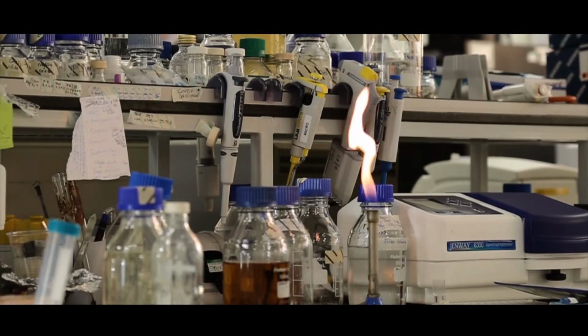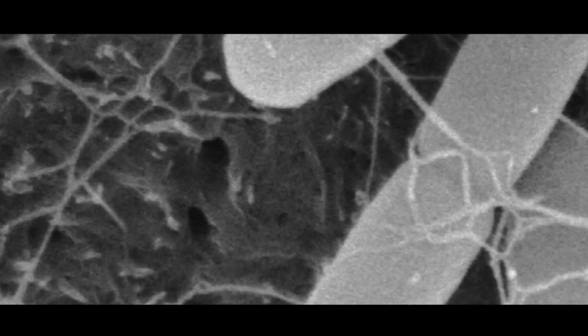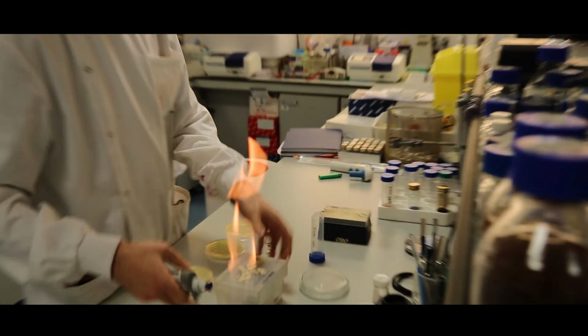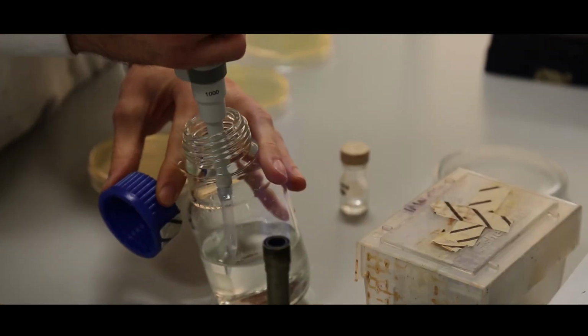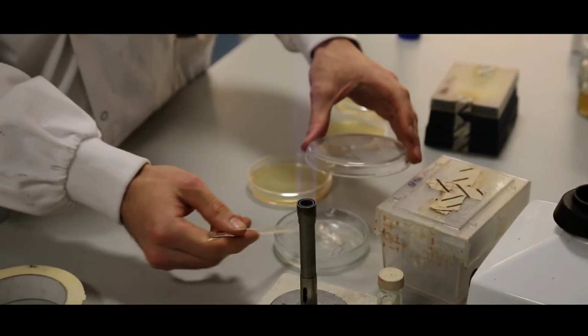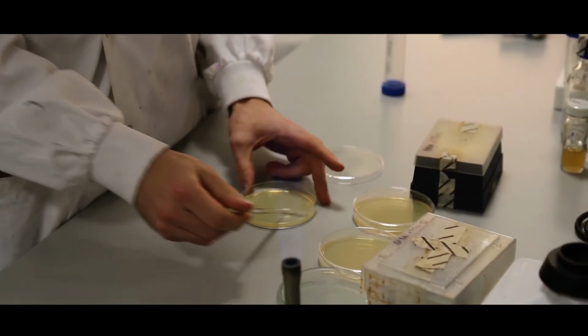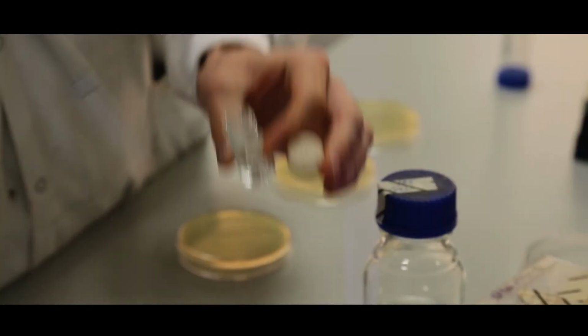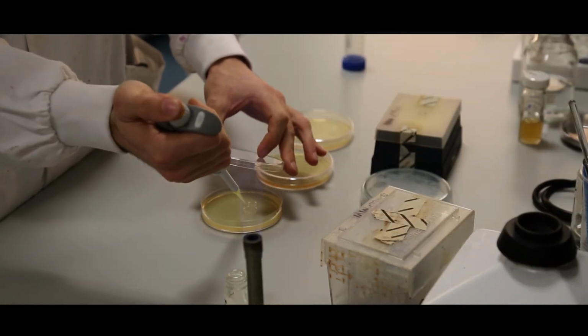Biocare Marine holds a stock of extracts from bacteria that were isolated from fish and shellfish. We have been testing these extracts for their ability to inhibit the growth of other bacteria, especially those that can cause disease in humans, such as MRSA and E. coli. To do this, we first spread a layer of a disease-causing bacterium onto an agar plate. We then dispense a drop of the test extract and incubate overnight.